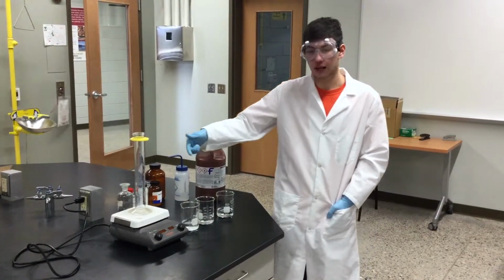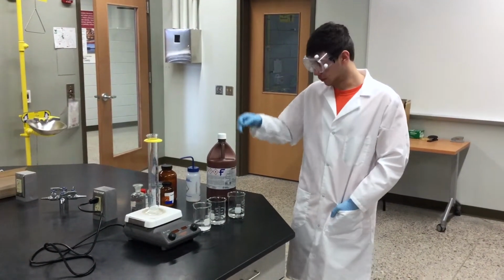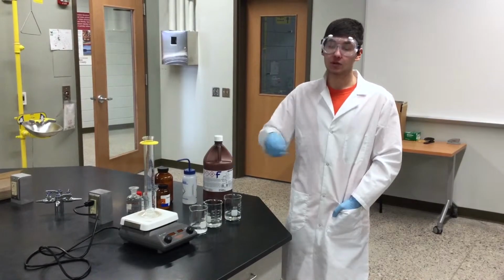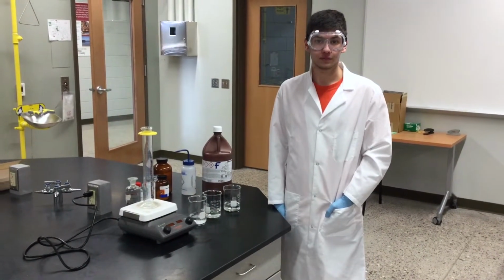At this point now we're going to add solution A and B together. We're going to let them stir. After they're done stirring, we'll add solution C, at which point the oscillating reaction will occur, and it'll go for about 5 minutes or so.